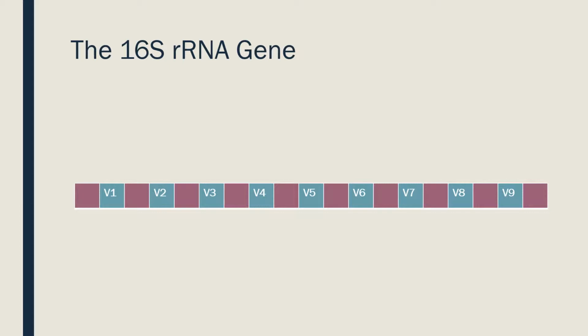The traditional method of analyzing these microbial communities has involved the 16S rRNA gene, a highly conserved gene within species of bacteria and archaea. This gene has 9 hypervariable regions, separated by constant regions. Primers corresponding to one of these constant regions are used to selectively amplify the 16S rRNA gene through PCR, and next-generation sequencing technologies are employed to sequence these genes. Species identification can then be carried out using BLAST.